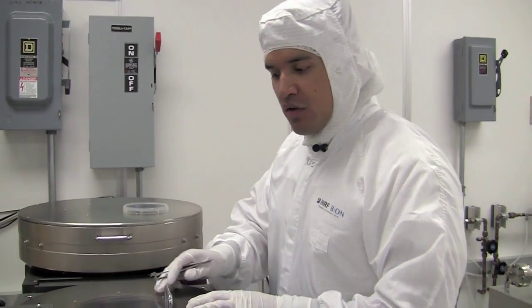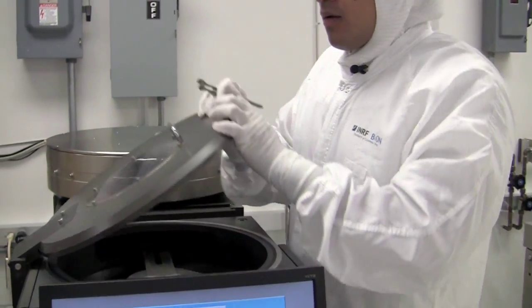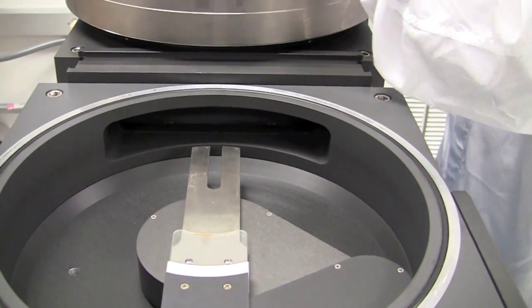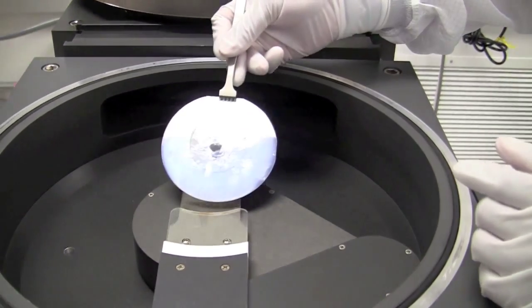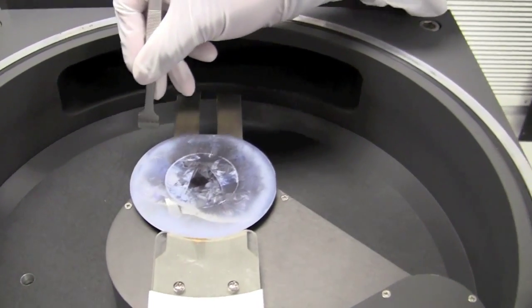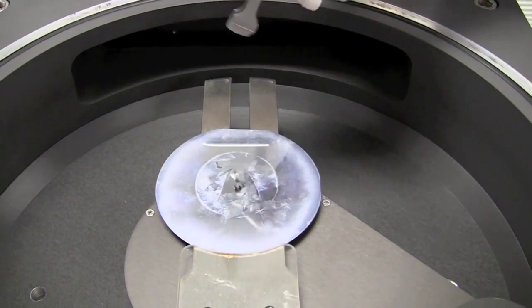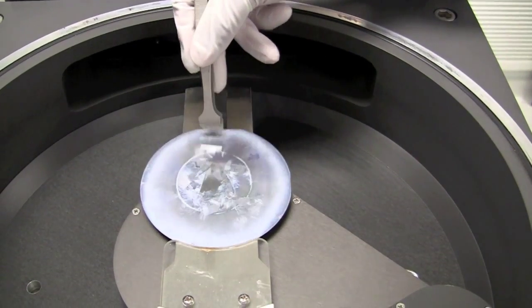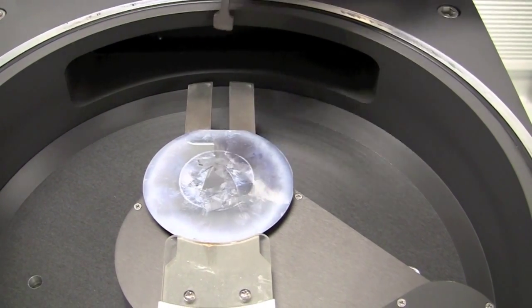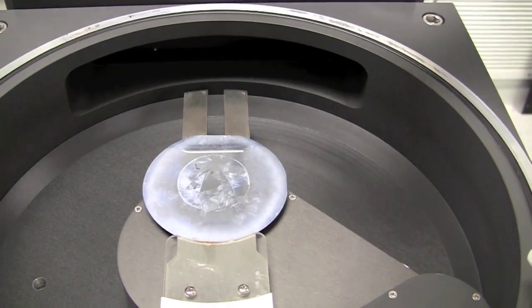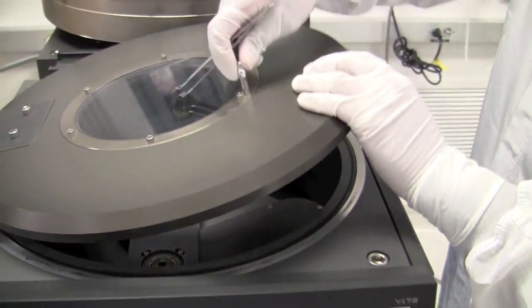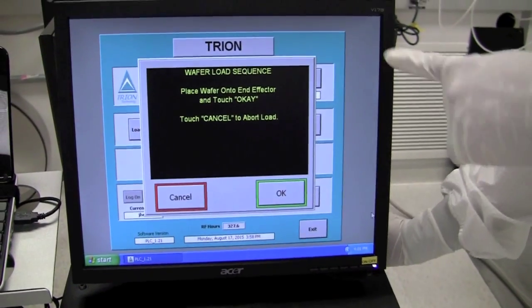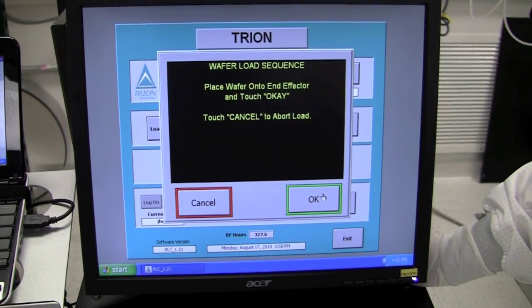So, once our chamber has vented, we can now begin to load our sample. You open this hatch and here we have the reactive arm with a space for our sample. To load our sample, you simply use your tongs and you can put it in. Now, technically it doesn't matter how you orient the sample, as long as it's touching this little flat. However, for our benchmarks and for our studies, we prefer the flat to be facing this way toward the chamber. So, once it's situated there, we close the hatch and on the screen, we confirm that the wafer is on our end effector and hit OK.